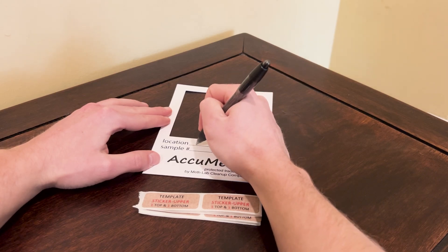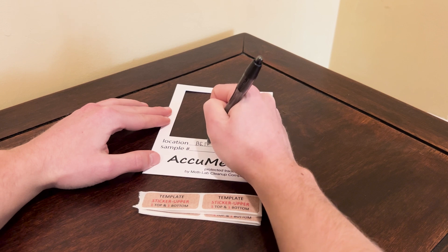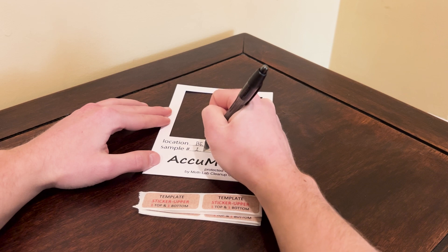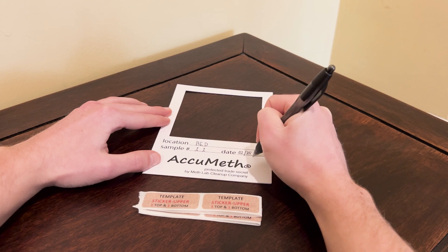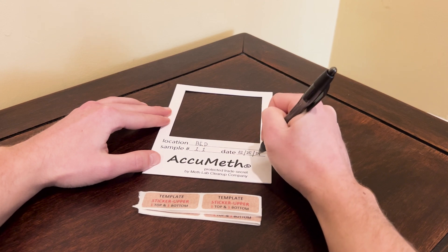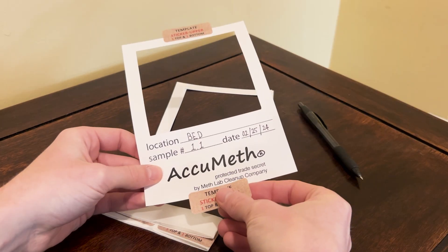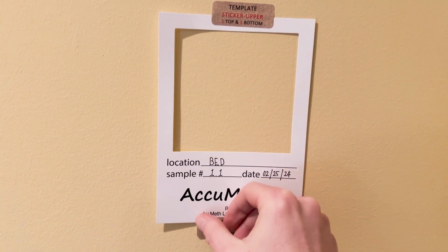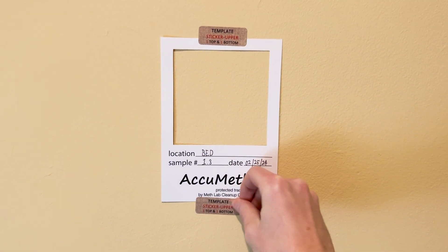For posting up your sample templates in the four areas to be tested, you'll want to label your templates. Here you can see I'm labeling these templates 'bed.' Since we're testing four areas for one average result, I'm numbering these templates, and you can also put the date — I put the 25th of February. Go ahead and use the stickers provided. Put one sticker at the top and one at the bottom of the template to attach it to the non-porous surface. Repeat this process for all four sample templates so you can prepare to test all four areas.